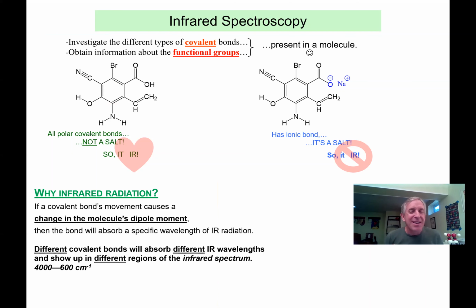That's the theory part. Keep in mind the region that we use is from 4,000 to 600 inverse centimeters. Inverse centimeters is a weird little frequency, but it's the most common one that's used in IR, so we'll have to adapt to it.